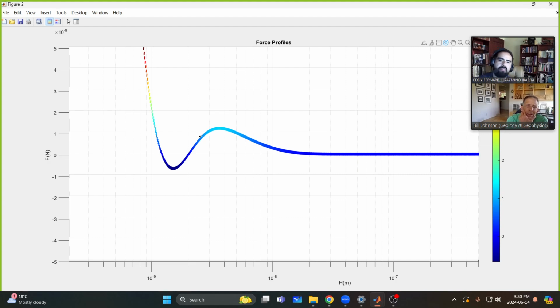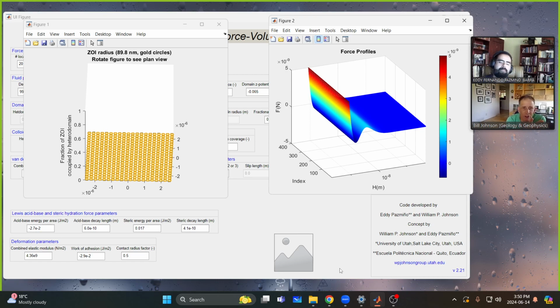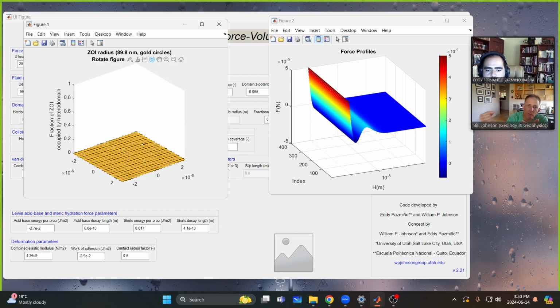Yeah, but the main point is everything is the same everywhere. Yeah, and notice how there's an artifact here that makes it look like the series run horizontally. They don't. It just happens with the data density that it looks like these are running in bars transverse to these profiles. But in fact, there are profiles for each location. It's just that they are identical, so they create this two-dimensional figure. And you'll see when we start to add heterogeneity that the profiles are associated with each location.